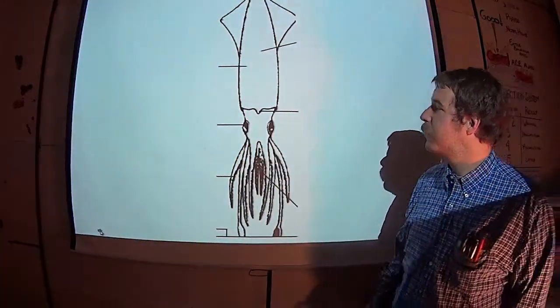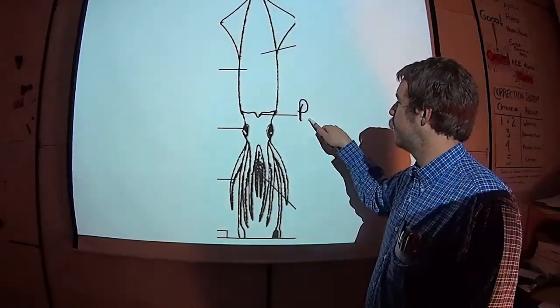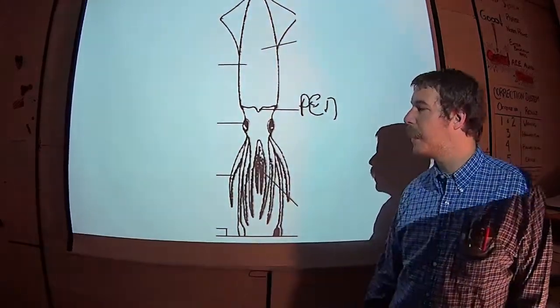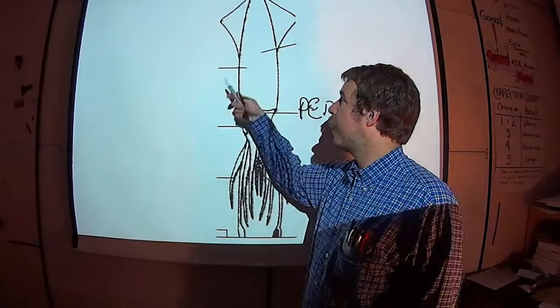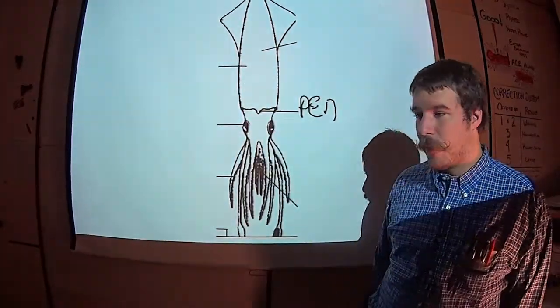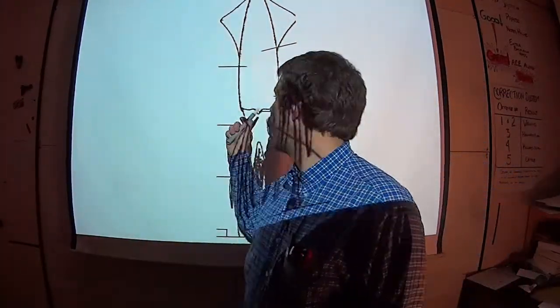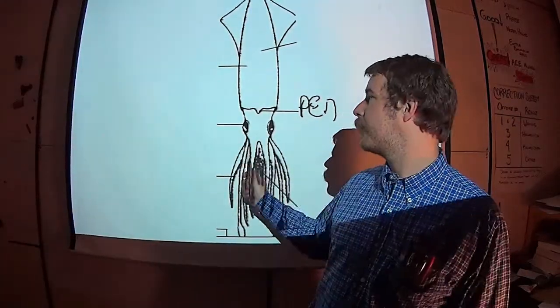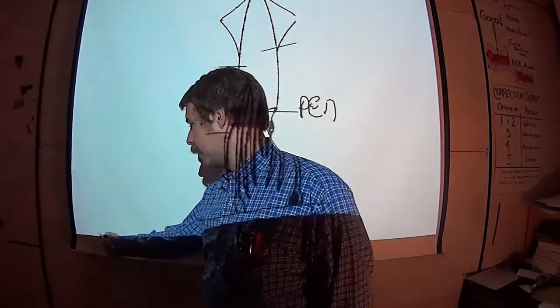Here's a picture of the squid. This is dorsal side up. You'll see right here this is actually the pen which is a nice supportive like backbone type structure and you should be able to see the eyes and the mantle and whatnot on the outside. This is not the side that you're gonna cut. If you have the pen side you need to flip it over. The pen's nice and hard and that should be on the bottom when you're dissecting.